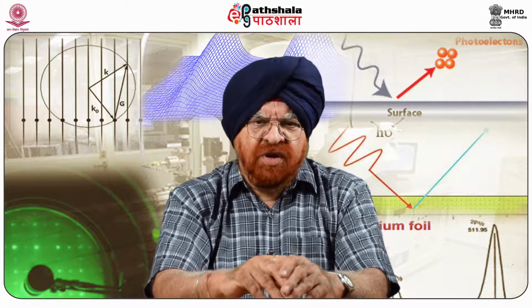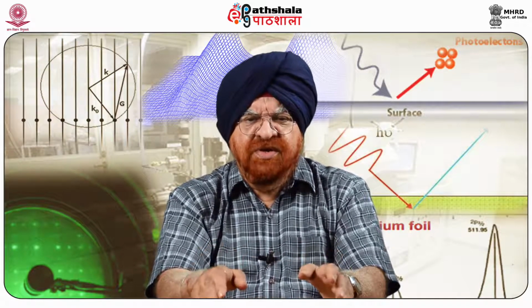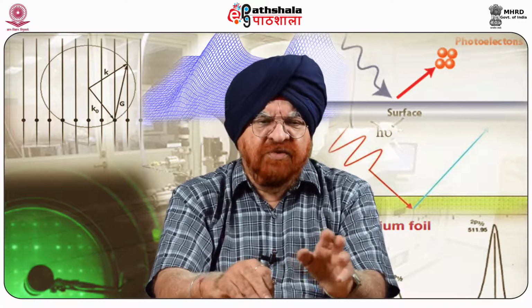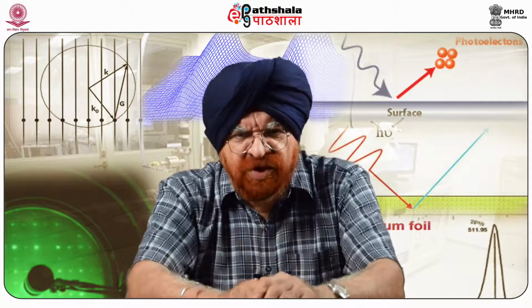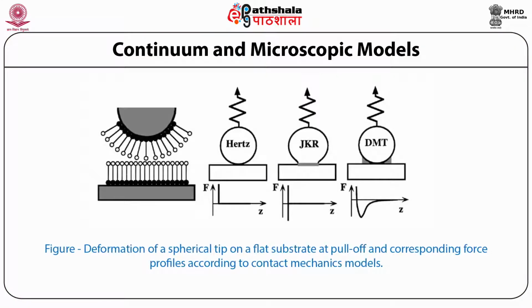Use of the JKR model to correlate adhesion forces and surface free energy also allows estimates of the number of interacting groups, which is a very important parameter. This slide gives figures which indicate deformation of a spherical tip on a flat substrate at pull-off and the corresponding force profile according to the contact mechanical model.